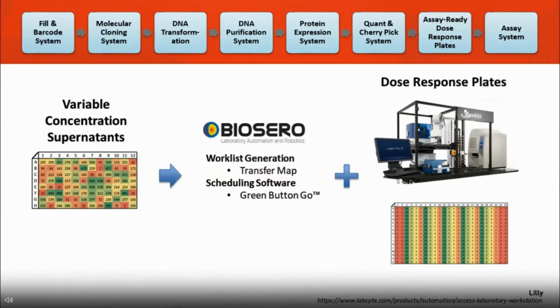And so we worked with the folks at Biosero and incorporated their transfer map worklist generating software and the scheduler Green Button Go to drive this system to do exactly this. So we can now take the variable concentration supernatant material, take the same type of dose response plates, and then generate worklists and feed them to the Echo to accomplish this task and eliminate that normalization step. And so this is something that's been in place for a good chunk of this year now, and it's been working nicely. So it's a nice example of a software solution to really streamline our workflow a bit.